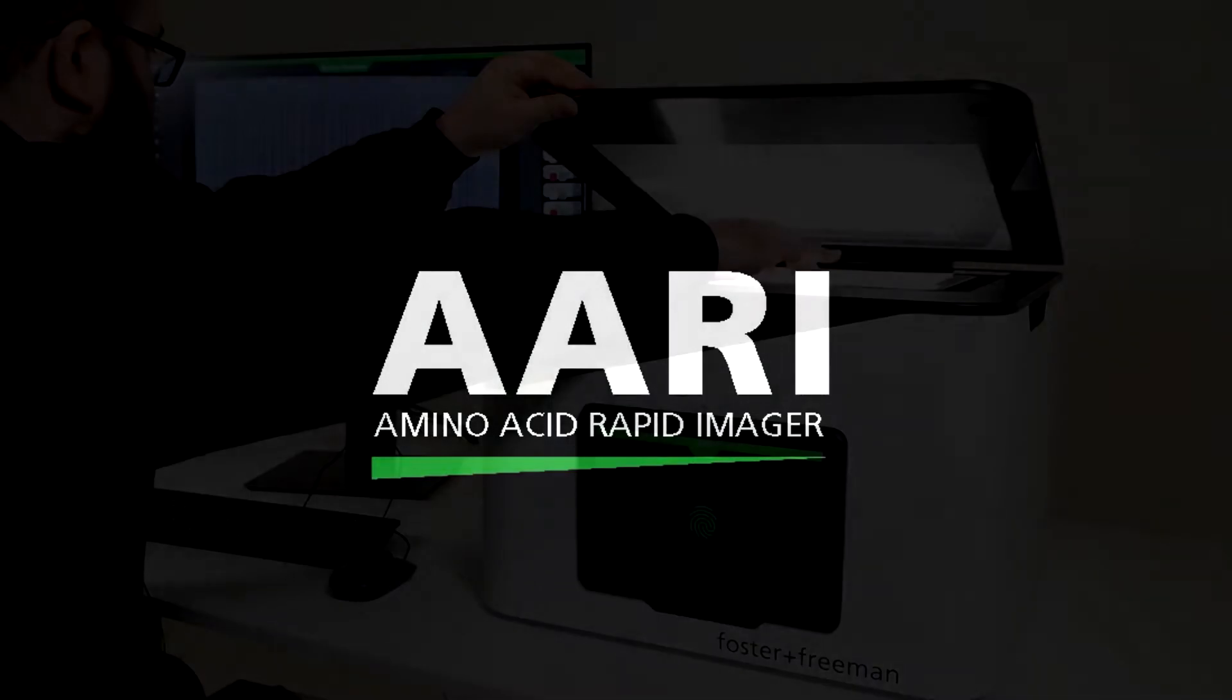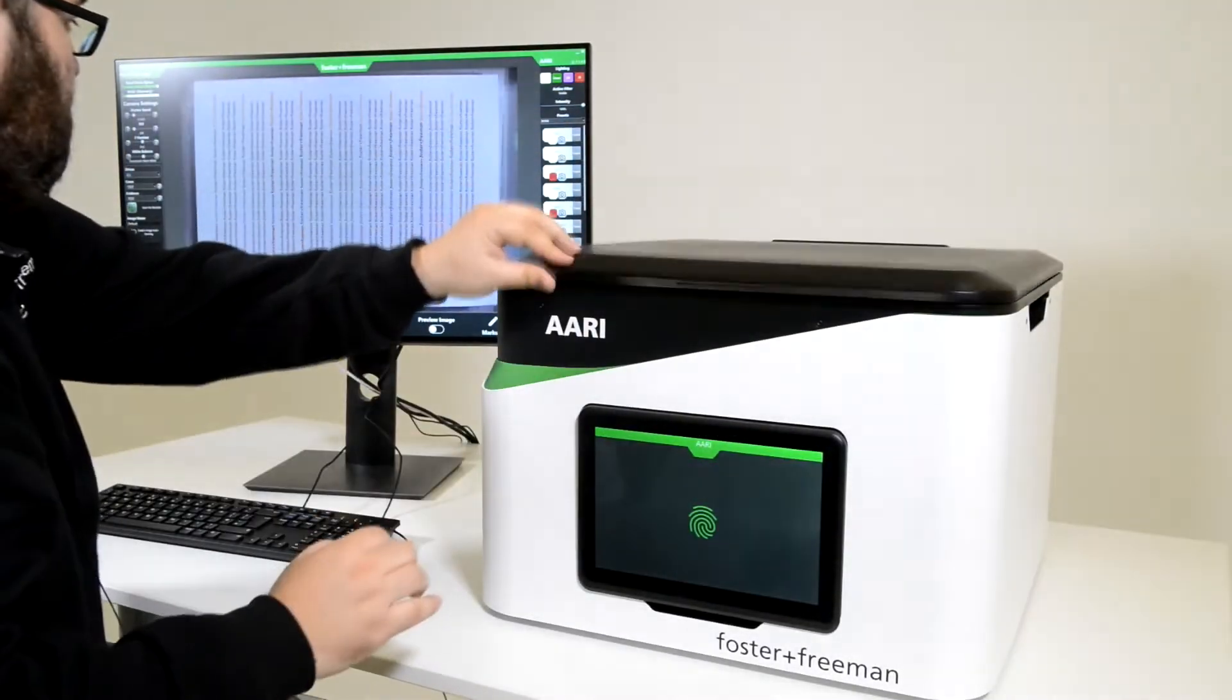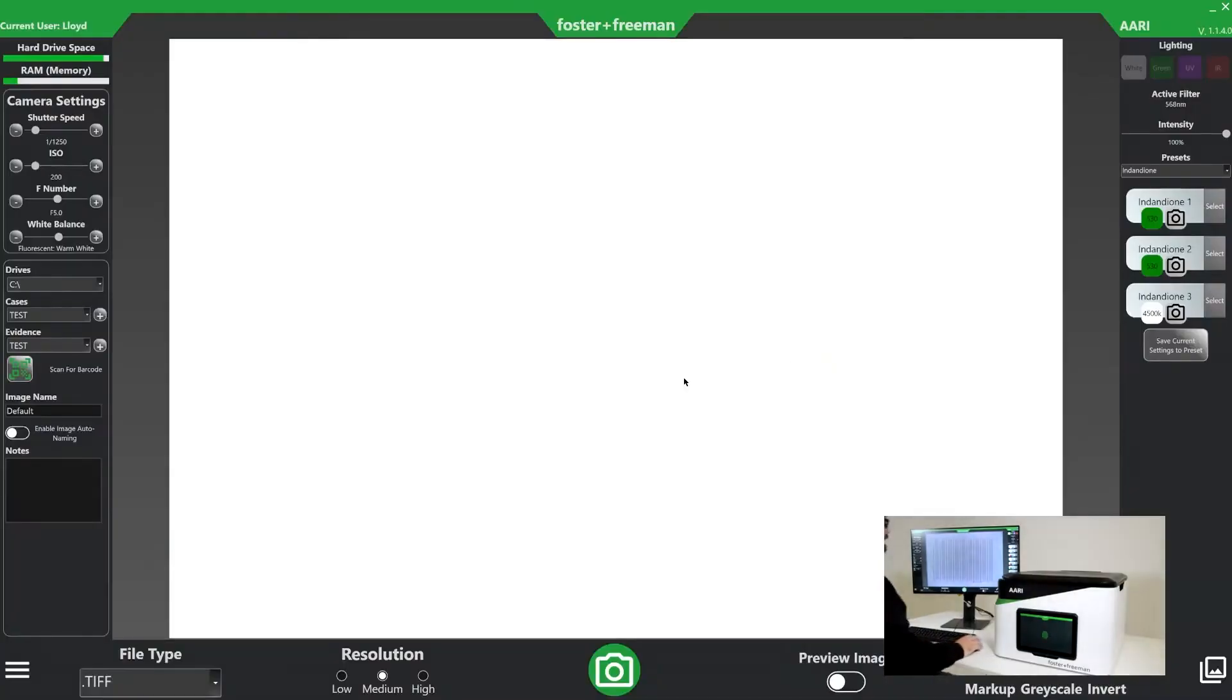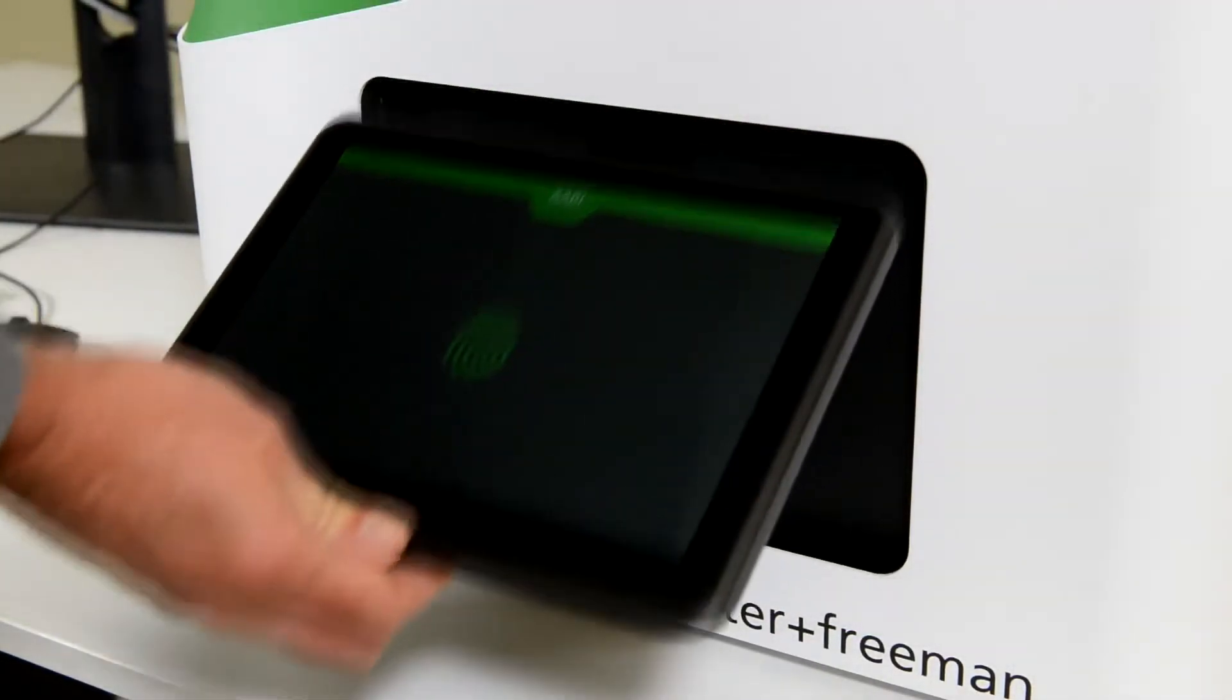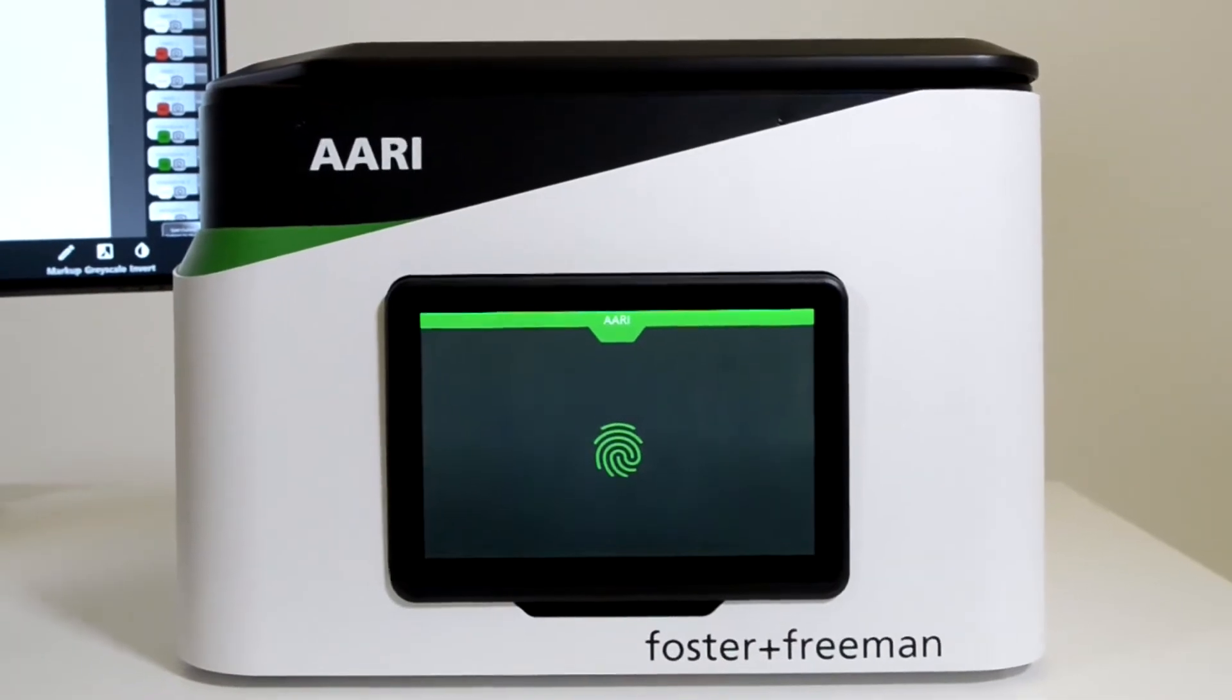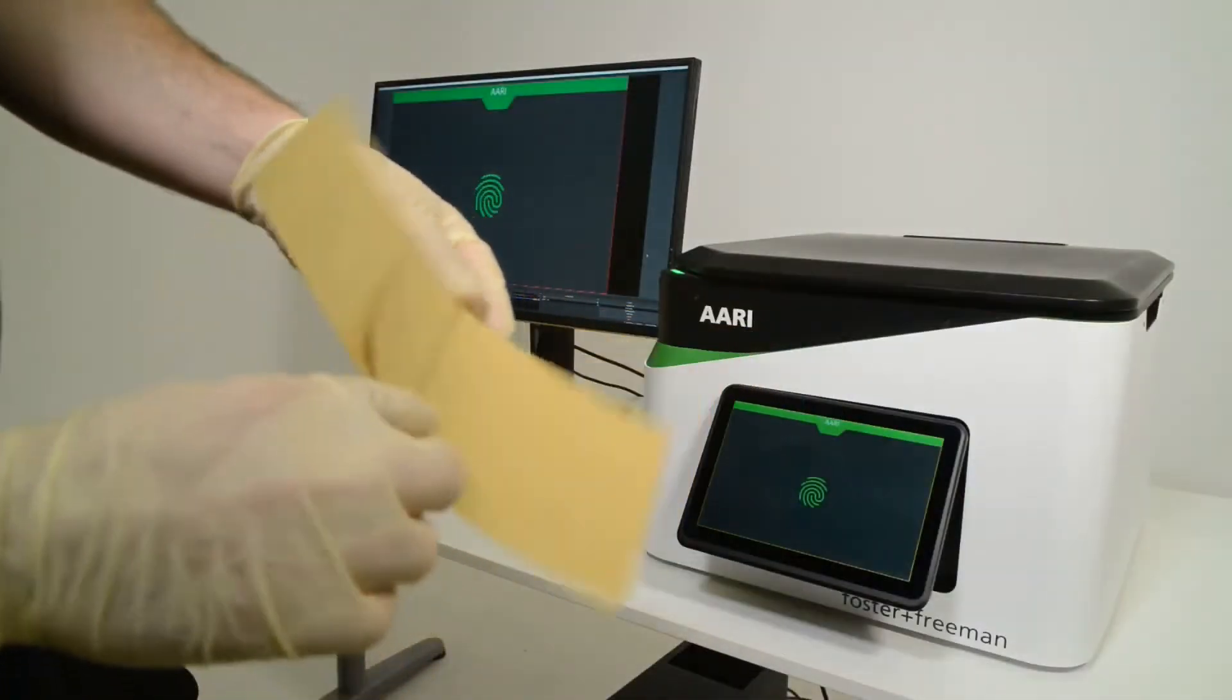With a high throughput device, the AARI Amino Acid Rapid Imager is primarily a time-saving system that has been designed to dramatically increase the speed at which finger marks treated with amino acid-based processes can be visualised and photographed.